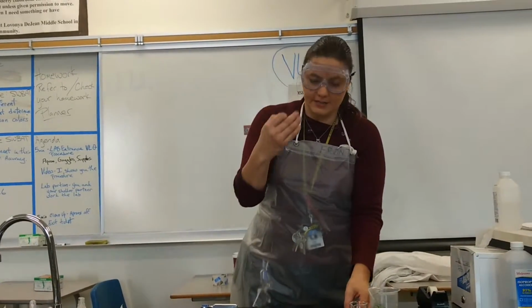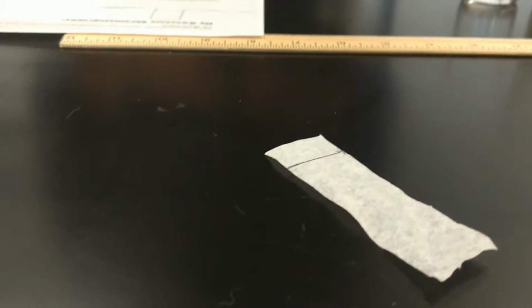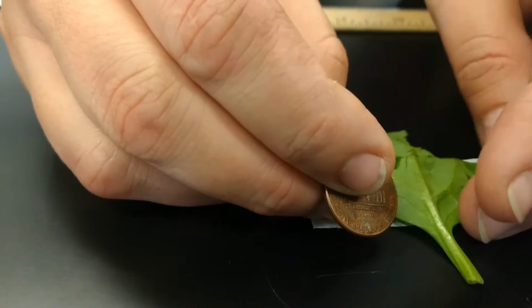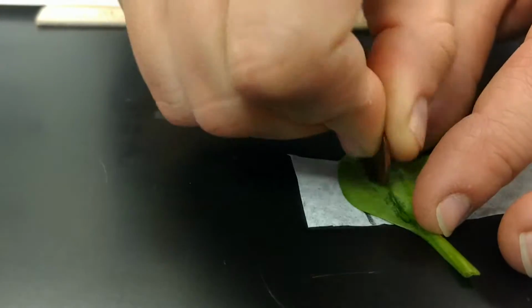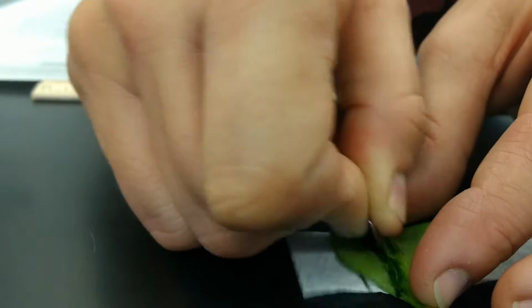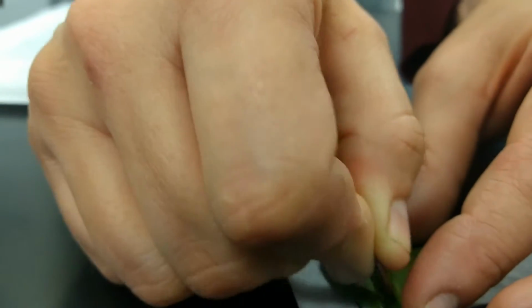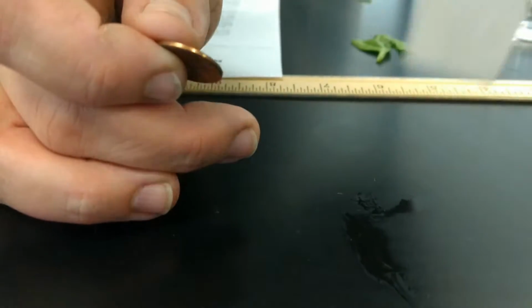So I'm going to take it, go ahead and get close, Matthew, and it says what I'm going to do is above the line, which means towards the larger piece, take this and roll the pigment across above the line. Roll, roll, roll. We want to get as much of the pigment on here as possible, so we're using the edge of the penny because that cuts in and actually gives us a little bit of the juice or the extract. Perfect. That is a lot of extract. Look at that.